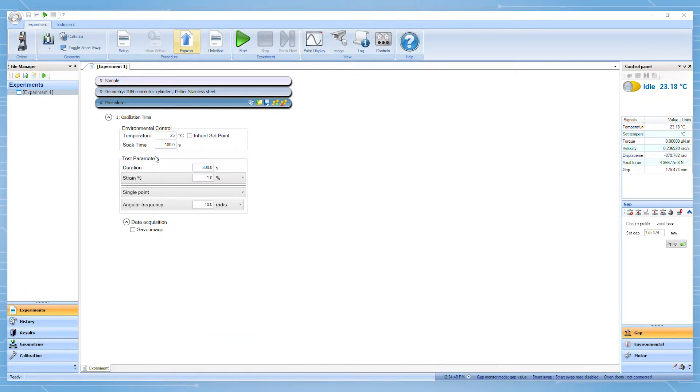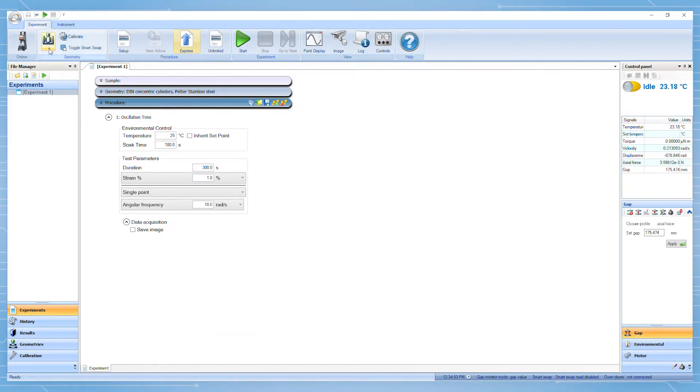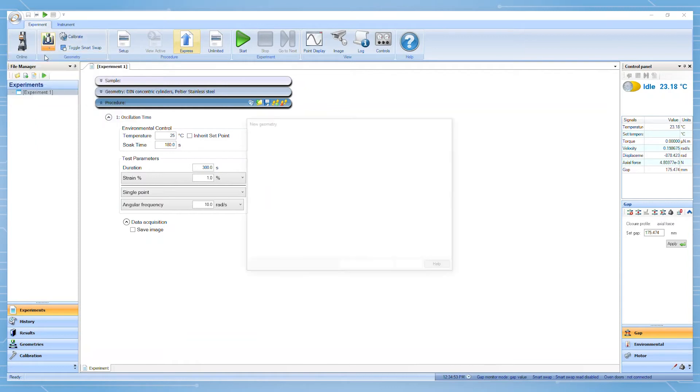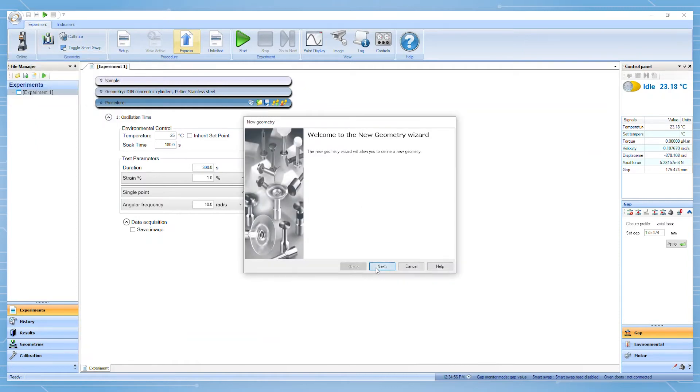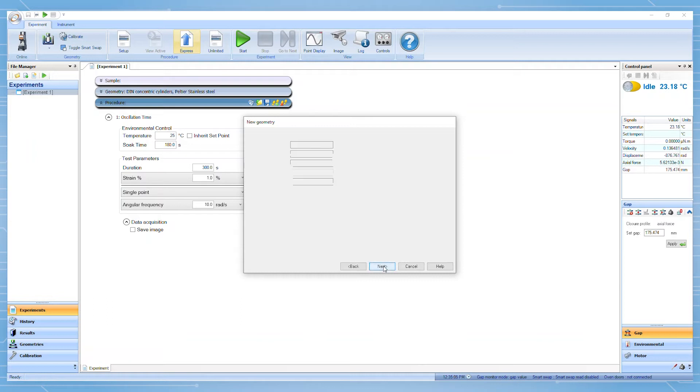In the TRIOS software, if a geometry file for concentric cylinder has not previously been created, the operator will have to create one. Under the geometry list, add a new geometry and select concentric cylinders. Enter in the relevant geometry measurements including rotor diameter, rotor length, cup diameter, and the geometry material.